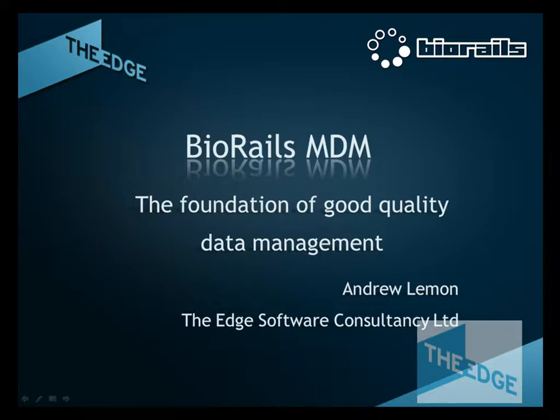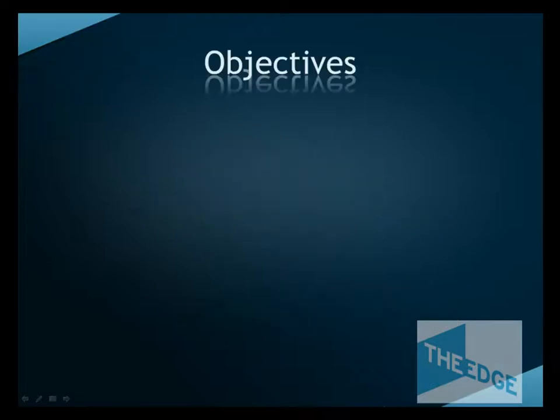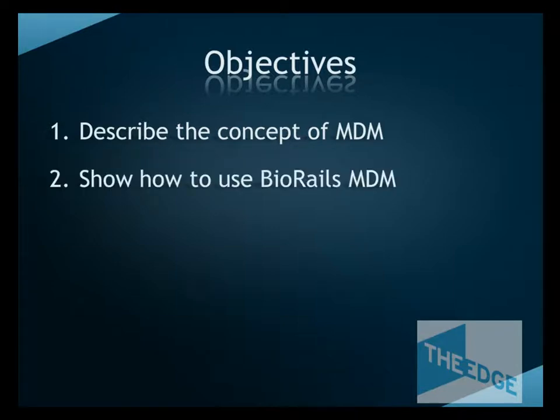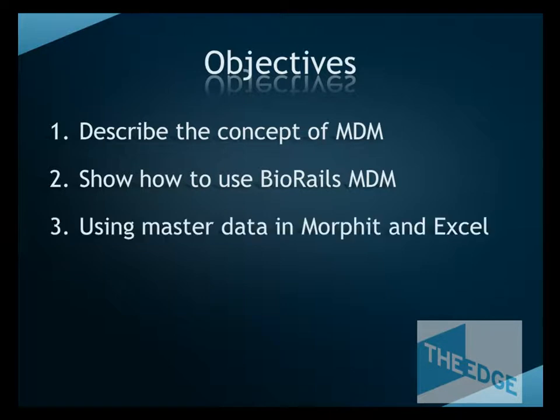Today I'm going to talk to you about the BioRails Master Data Management module. Master Data Management should be the foundation of any good quality data management system. The objectives of this presentation are to describe the concept of master data management and its application within the biopharmaceutical and pharmaceutical industry, and show how to use the BioRails Master Data Management module, and then show an example of how to use that master data within Morphit and Excel.